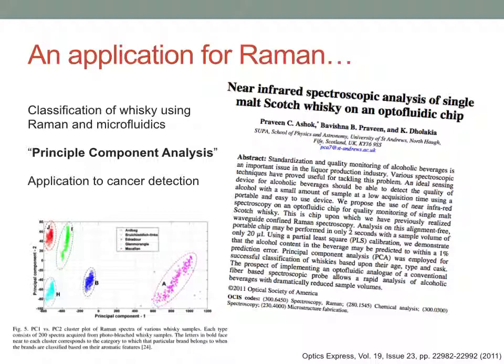They were looking at Raman from urine samples and being able to detect cancerous or precancerous cells in a urine sample. So this is looking at bladder cancer, which is very, very difficult to detect. And this group, whilst they had this fun paper on whiskey, is using exactly the same techniques to look at cancer. And we couldn't do that with infrared.